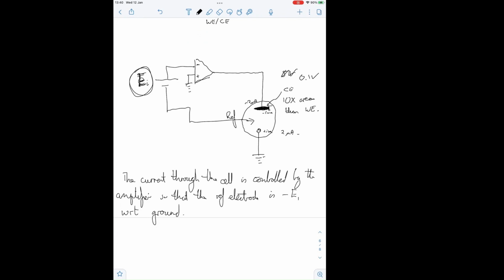So that counter electrode is 10 times bigger, so I don't need to apply a massive voltage to my counter electrode. At least, I might not know what reaction is going on there, or hopefully it's the opposite reaction of what's going on at my working electrode. But at least it's not going to a high voltage where I have really no control.